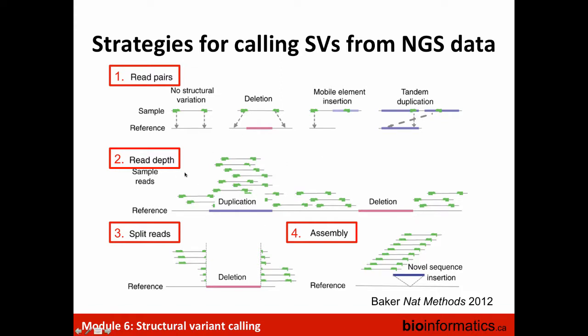So this is going to help us detect the copy number, so just the amount of reads in a given region. Another trickier one, I guess, but also a source of information, is if one read maps correctly, but the other read basically only maps partially. So this is called a split read, where one read doesn't fully map, it maps and then doesn't map anymore. So we'll be able to use these patterns, which we call split reads, to refine exactly where the breakpoint is. And then finally, there's this broad category of, well, I'll get to that, but assembly.